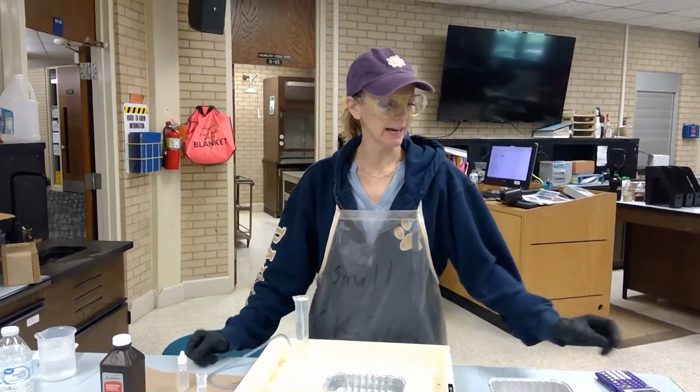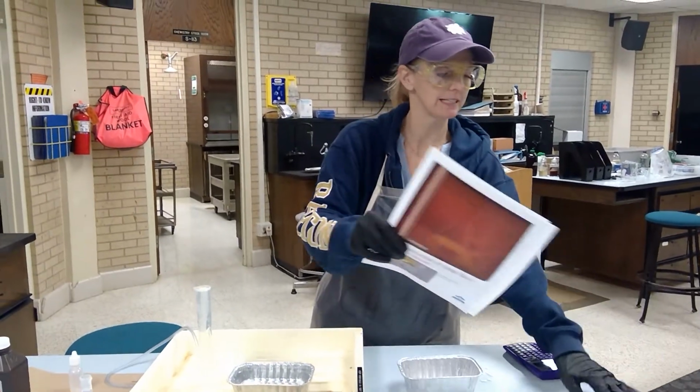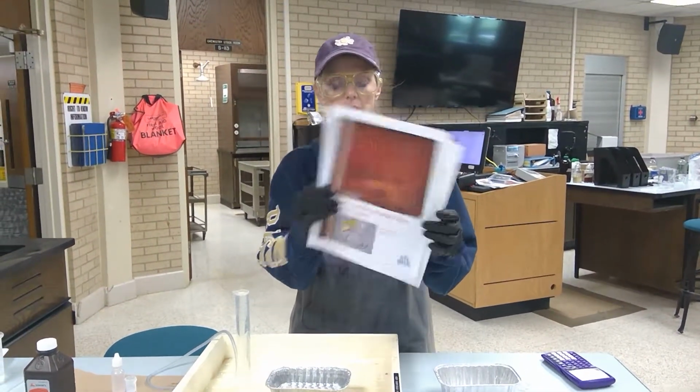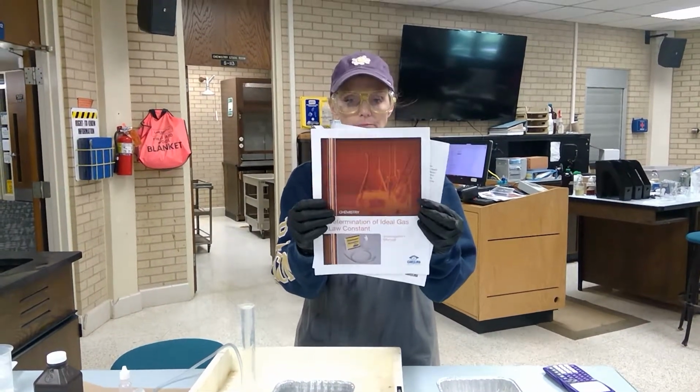Welcome back. I'm Dr. Kristen Hathcock, and today we are going to cover determination of an ideal gas law constant. In this particular lab, you will be calculating the R value.